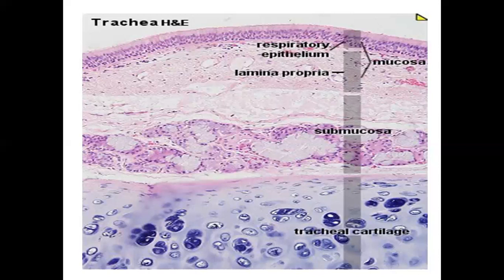Dense cell هذه هي الفاينل. تمام. اللي هي also known as small granule cells. They have ability. هذه شنو هي الفائدة أو الفانكشن مالتها من وجودها of its existing. It's having the ability to monitor the oxygen and carbon dioxide levels in the lumen of the airway. تمام. Some believe this is its function.